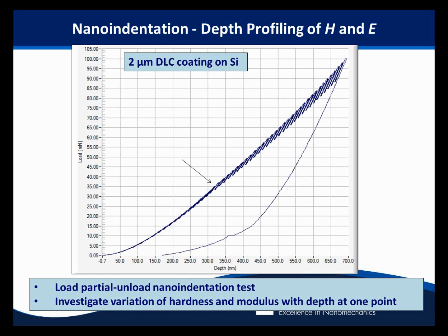into this graded structure. So you can see where I've shown an arrow there, you can see a rather dramatic discontinuity in the curve, and that's where the indentation plastic stress field that you use to determine the hardness has transitioned from being completely within the coating to being partially accommodated by the much softer and more compliant silicon substrate underneath. So there's a transition there, and possibly also a small crack.